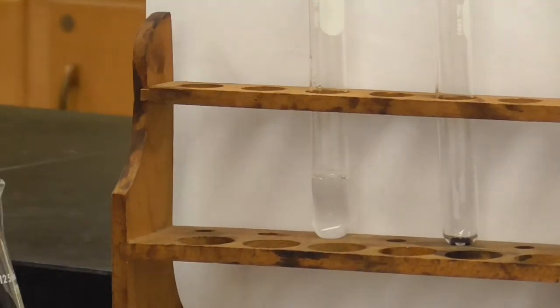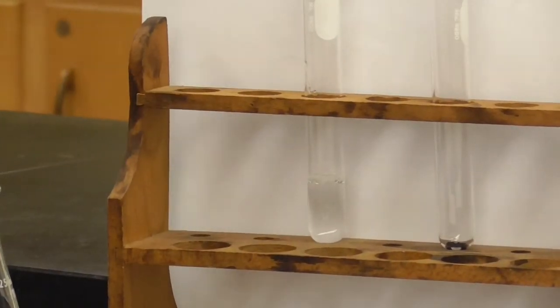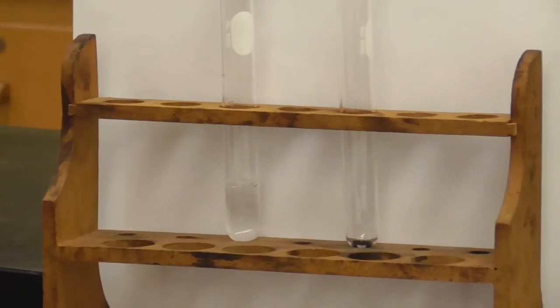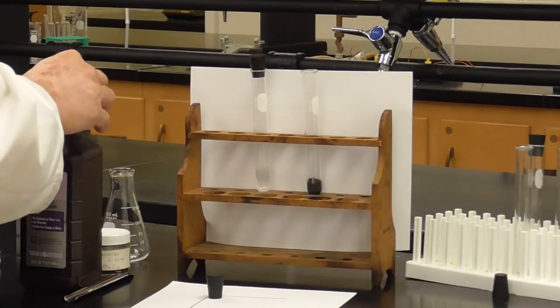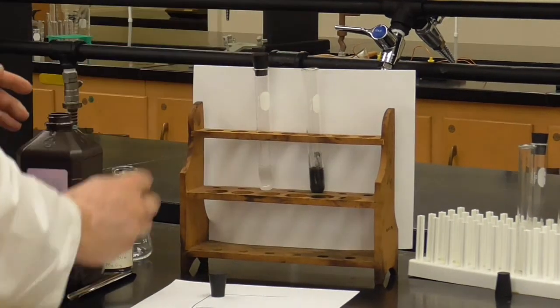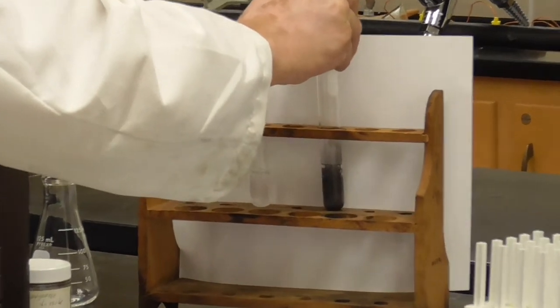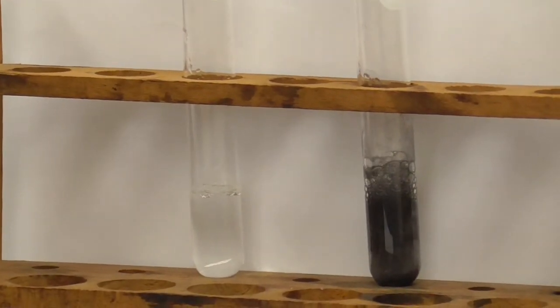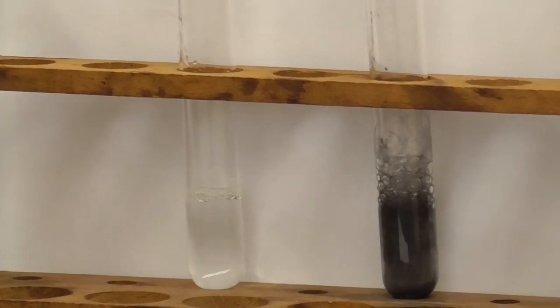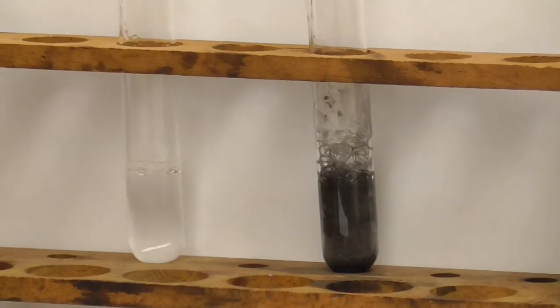And the second one, of course, we've got our catalyst already present in the test tube. We'll go ahead and put our 2 squirts of hydrogen peroxide in that one. 1, 2, and give it a quick swirl here. All right, and you can zoom in very closely on those 2 test tubes and see the difference having that catalyst makes. Watch that for a little bit.